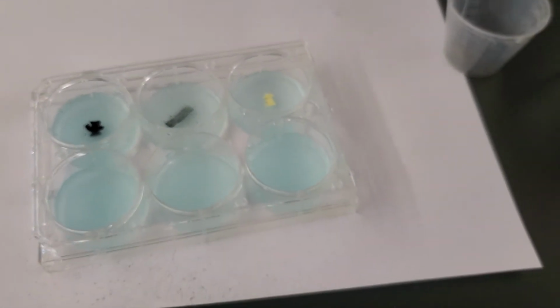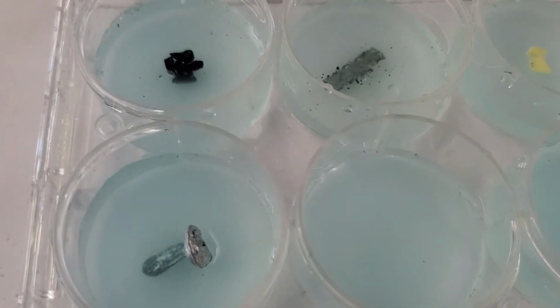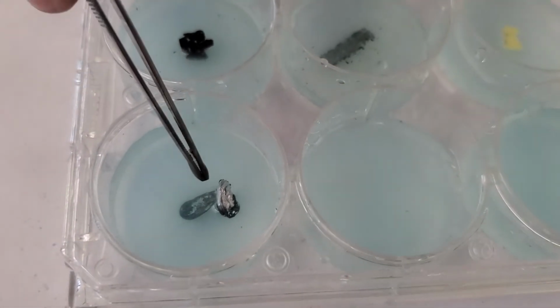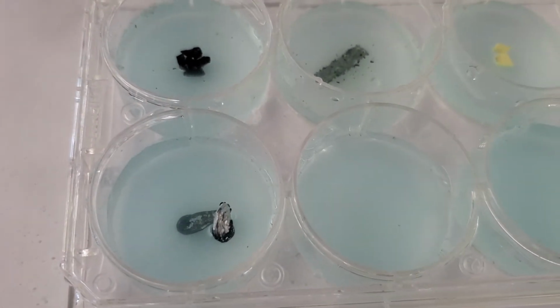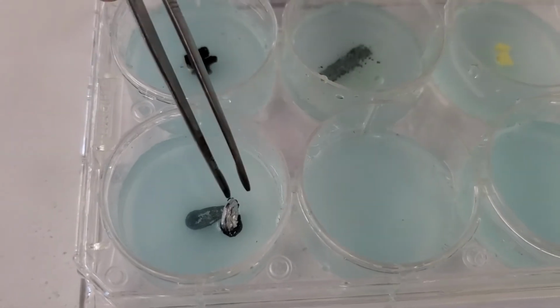Next one we're going to do zinc. Now don't look at this part here that's not submerged in the liquid. You want to look at the part that is submerged in liquid and look what's happening to it right away. You can see the color is changing quite dramatically.